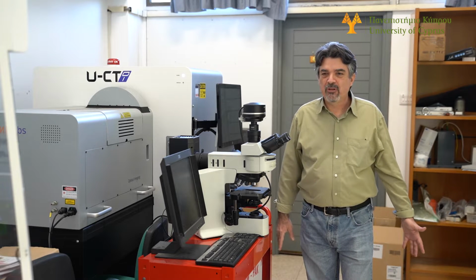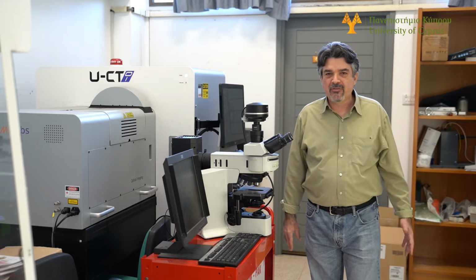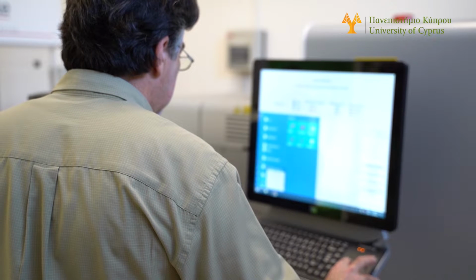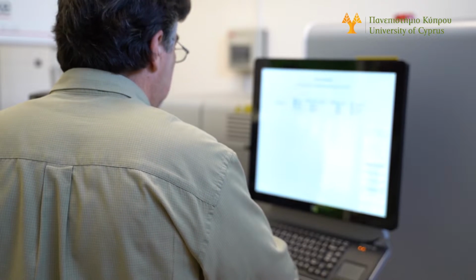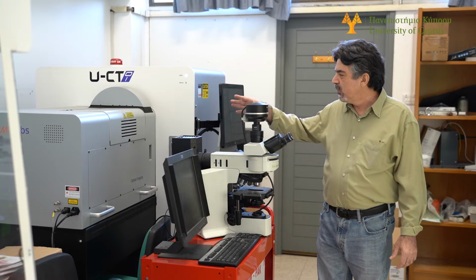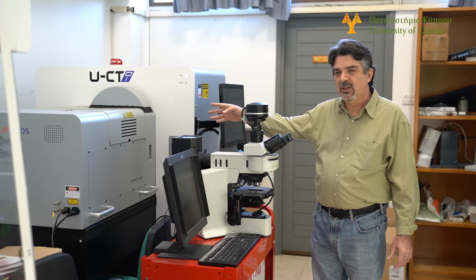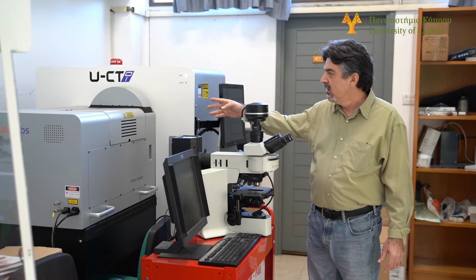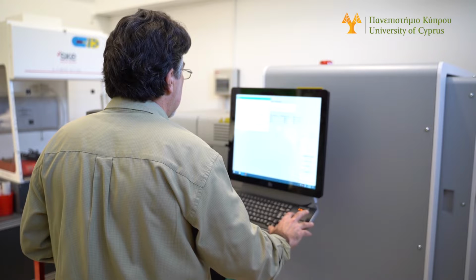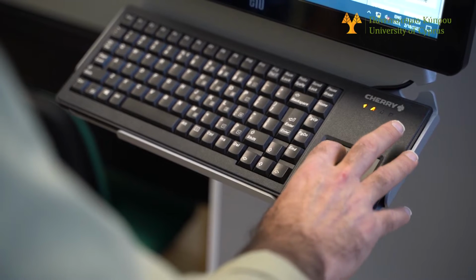This is the small animal molecular imaging lab. This is where we perform experiments on the response and nature of cancers in small animals, which allows us to experiment with novel nanotechnology-based sensing and therapy. The lab is equipped with a system that combines optical molecular imaging, fluorescence tomography, and a CT scanner to image small animals in 3 dimensions.